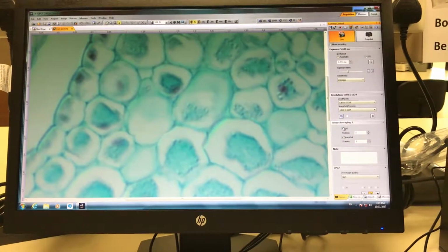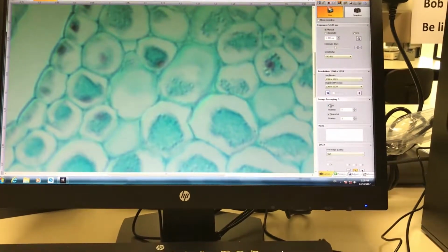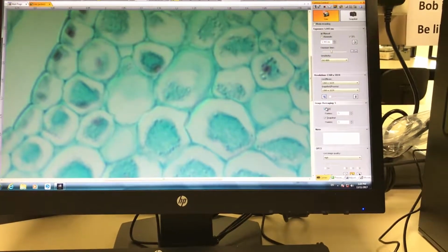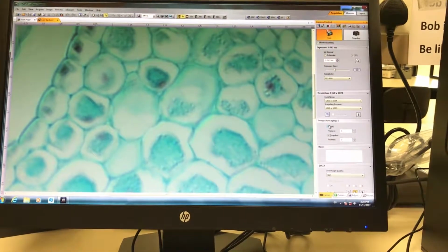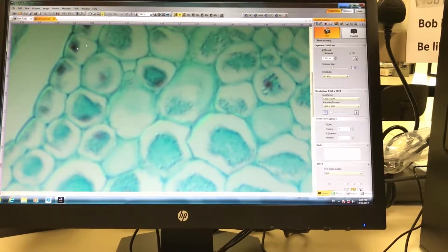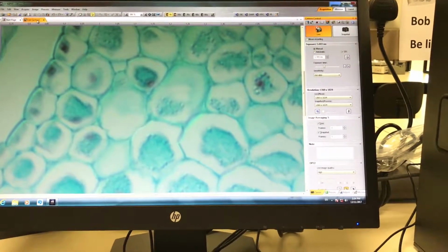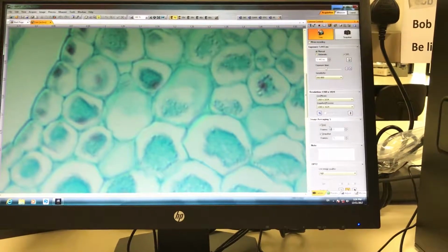Okay, so what happened here is, instead of taking one image, it is actually taking 5 images and then averaging them out. The noise happens randomly, so it will come and go. So out of the 5 frames, maybe at this particular pixel, it only comes once, so it will be neutralized. So that is how image averaging works.